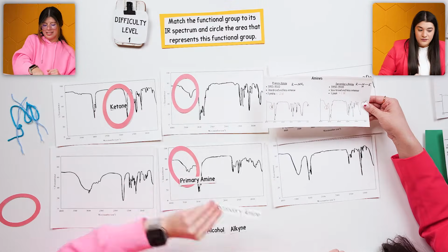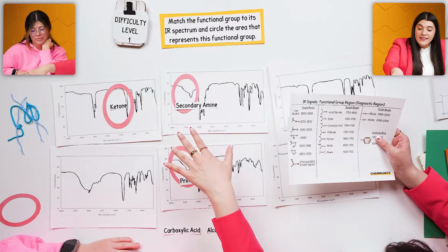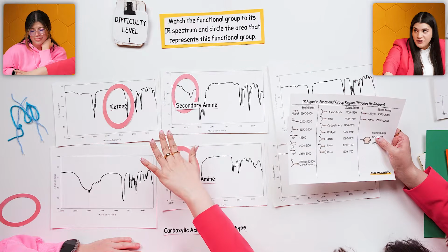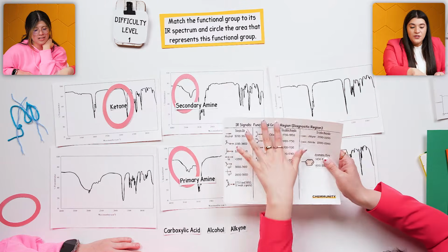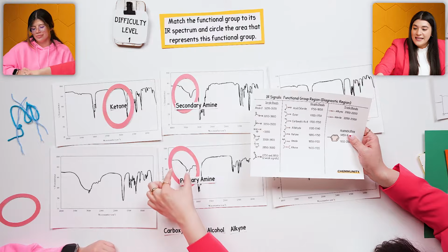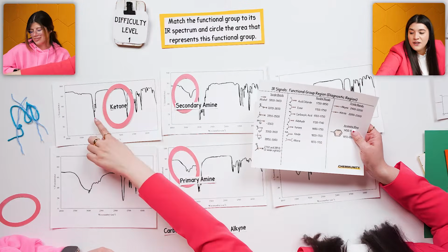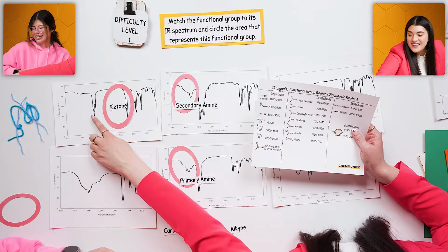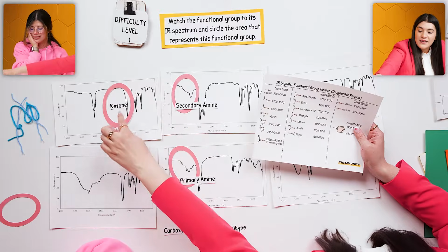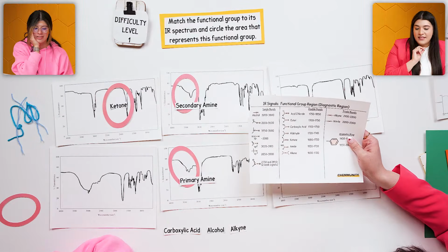So let's label each. Now, the first thing you want to do with these types of questions is look at the functional group region, which we said was greater than 1400. Now, you start to look at what it could possibly be. Is there a specific peak feature, and it's not just confusing you and telling you it's sp3 hybridized. Let's not get tricked by that. So whenever we see something that is within its own range, we can then figure out what type it is.